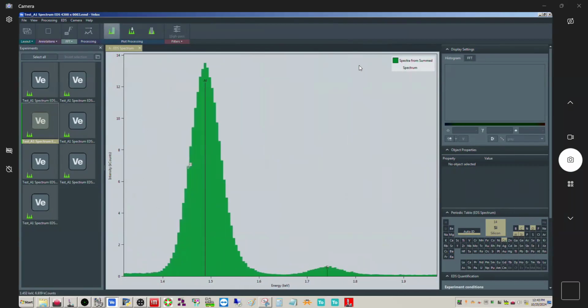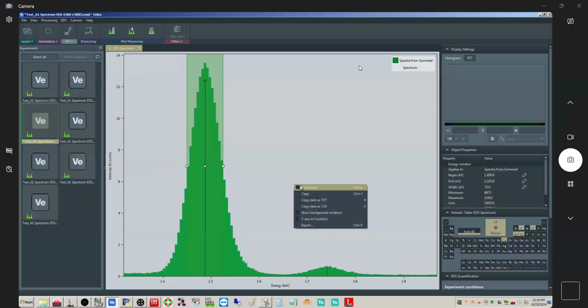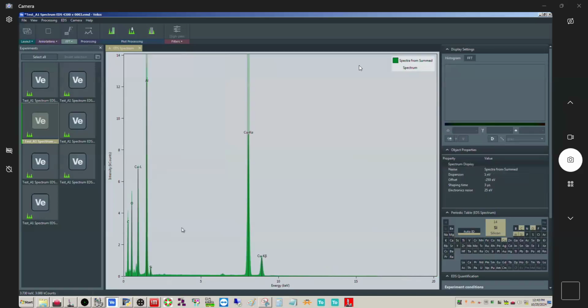So we'll call it about there. Yeah, so it's definitely the optimized seems to be giving a little bit better resolution. Very interesting. Not so sure about that, but all right, so we just leave it on optimized.